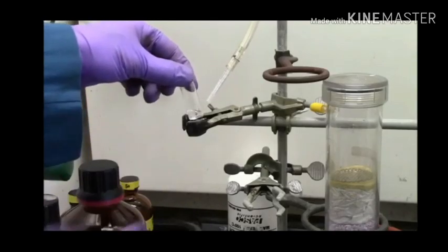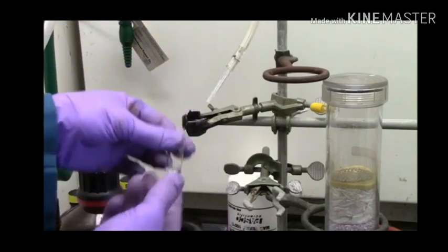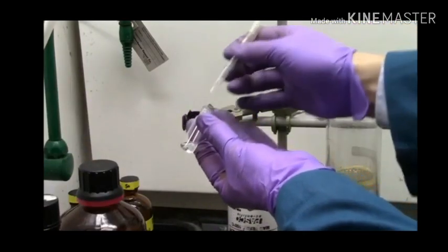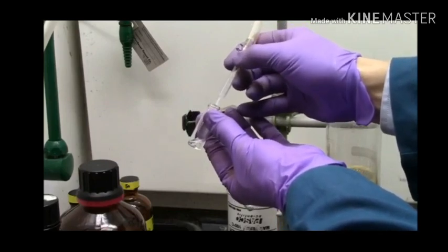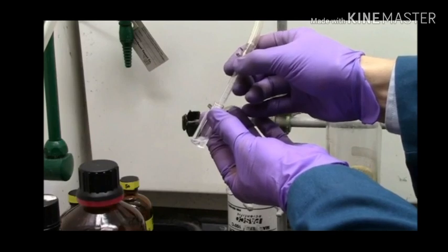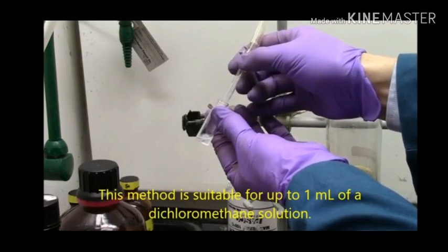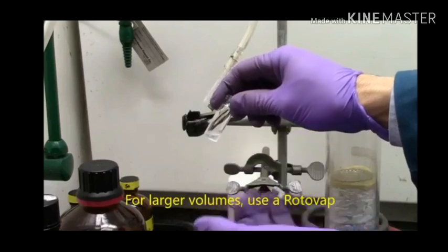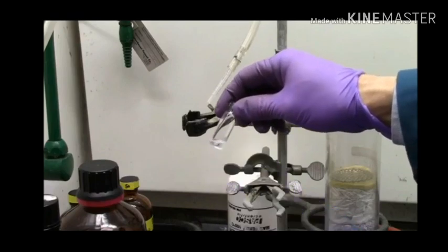Here I have a vial. It's got a little less than a milliliter of dichloromethane in it, and I will evaporate this using my stream of nitrogen. Here I've got the vial, here I've got the nitrogen stream. You can hear a little whistling as the wind goes through the opening of the vial. I can see ripples on the surface of the dichloromethane as it is being evaporated by the wind. It gets really cold here, so it's getting foggy because moisture is condensing on the outside. It's probably less than 0 degrees Celsius.